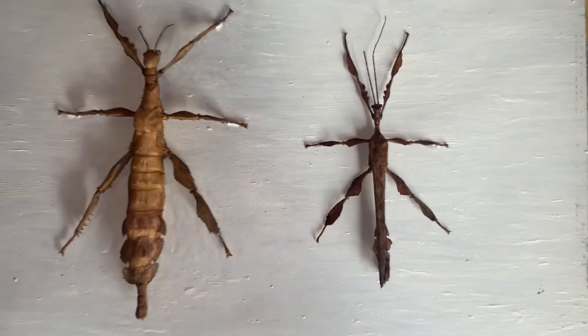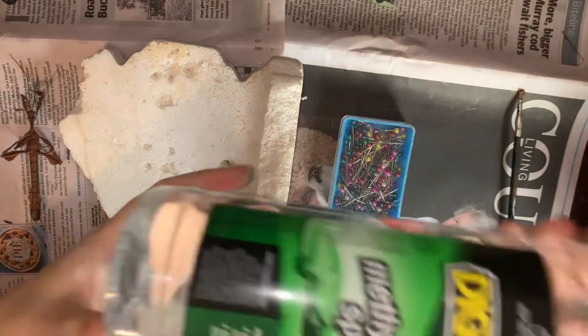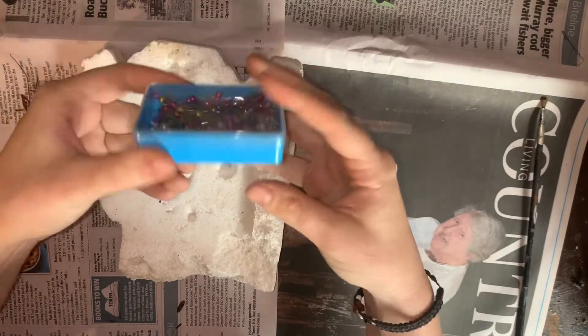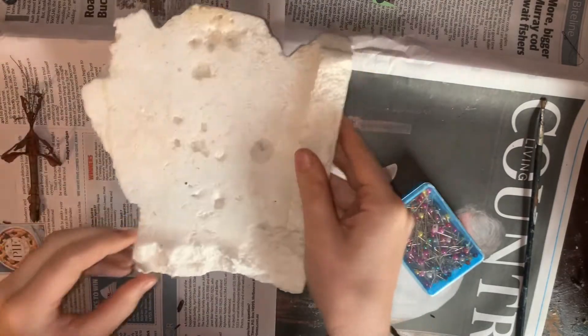In this first episode we will learn how to pin and preserve a male Extatosoma tiaritum in a basic pose. For the materials you will need: some methylated spirits, a small paintbrush, some large quilting pins, and a piece of styrofoam big enough to fit the stick insect you want to preserve.